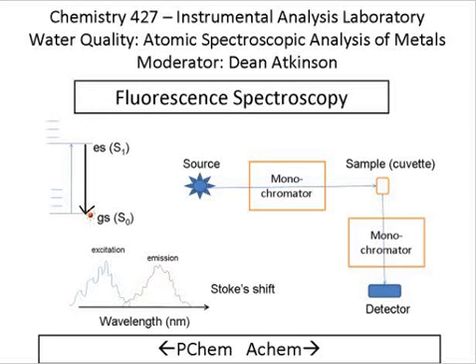The beauty of that experiment from an analytical chemist perspective, so again, there's a couple of different types of diagrams on this figure, and the thing at the bottom is to remind you that the stuff on the right-hand side tends to be how the analytical chemists think about fluorescence spectroscopy, and the left-hand side is sort of how physical chemists think about it, although there's quite a lot of convergence in between. Because a lot of analytical chemists tend to think about the physical chemistry side of the story as well.